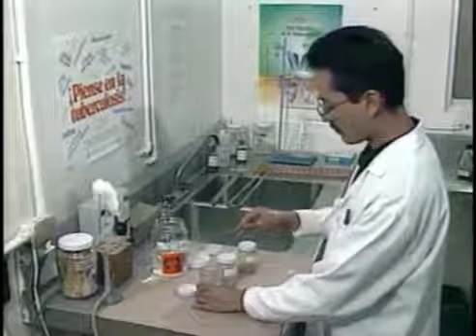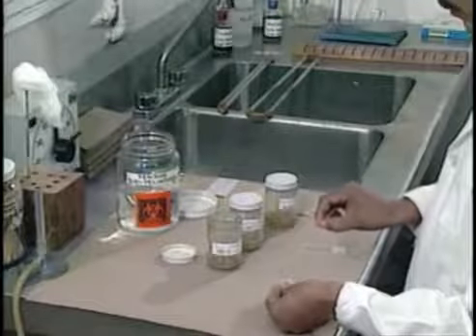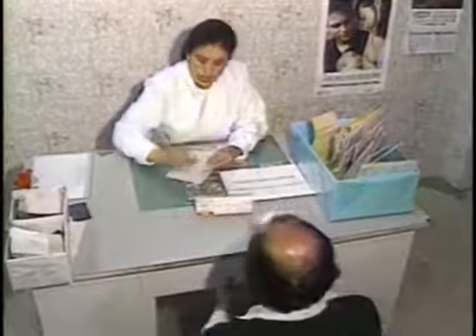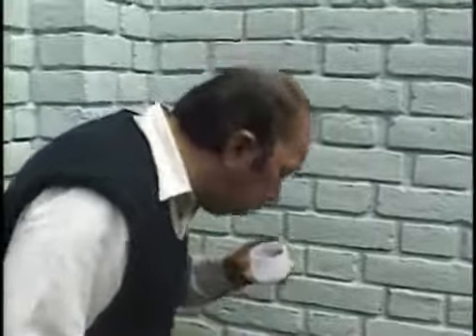Keep in mind, when appropriate techniques are employed, there is very little risk of acquiring infection in the laboratory. It is vital that all personnel be aware of potential hazards and work in a careful manner. The greatest risk of infection in the laboratory involves sputum collection. Preparing smears presents less risk to the lab worker than exposure to direct coughing. Since TB patients are sometimes directed to the lab for sputum collection, precautions must be taken to minimize the risk of exposure.